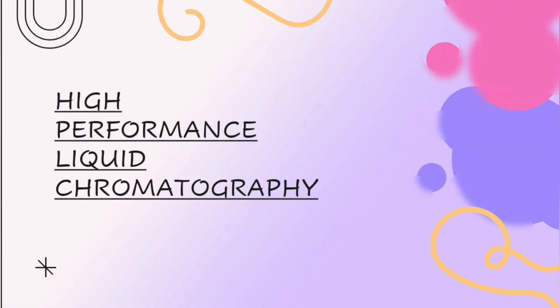Today our topic is high performance liquid chromatography. In this topic we are discussing the introduction, theory and principle, instrumentation, advantages, disadvantages and applications.